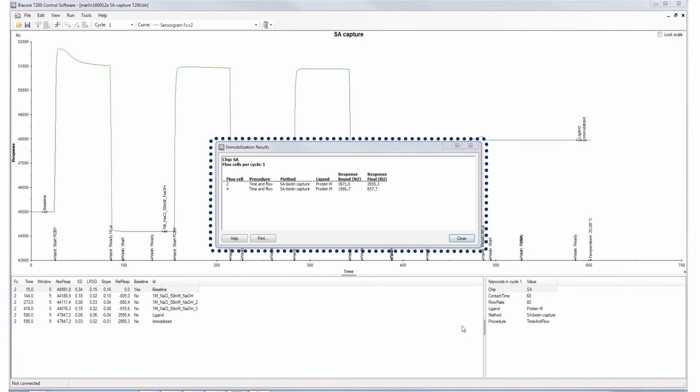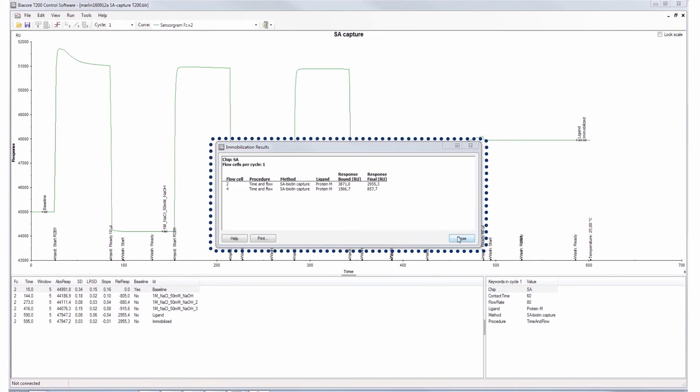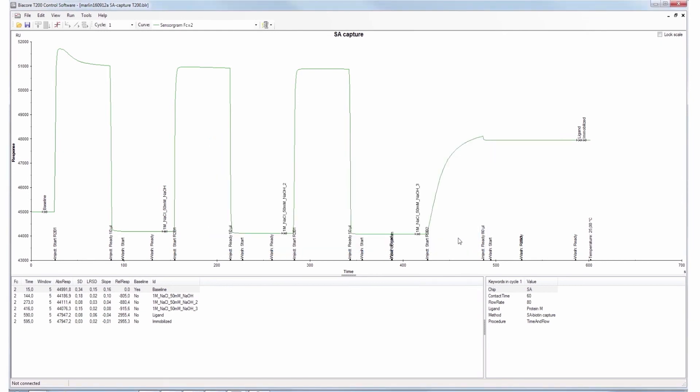When the method has finished, the capturing level is reported. The reagents and sample injections can easily be viewed in the sensorgram. The first three injections are the conditioning of the SA chip. The next step is the capture of the biotinylated ligand.